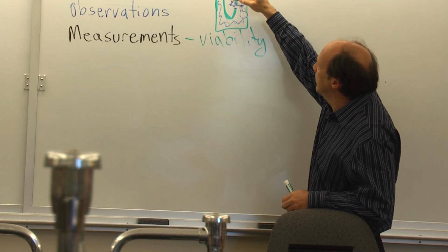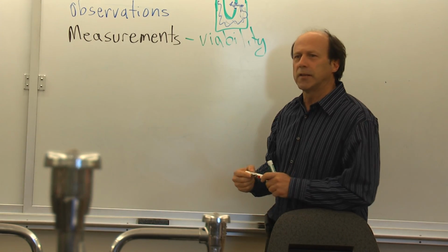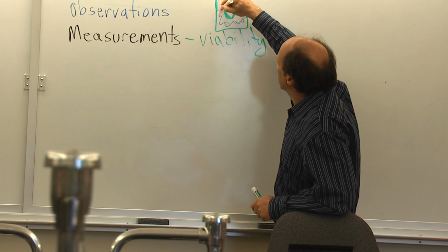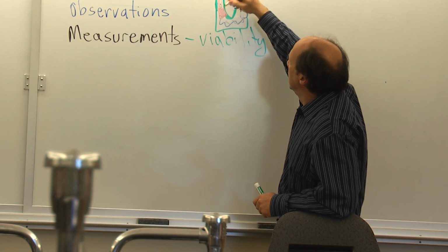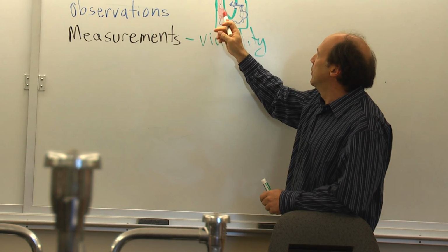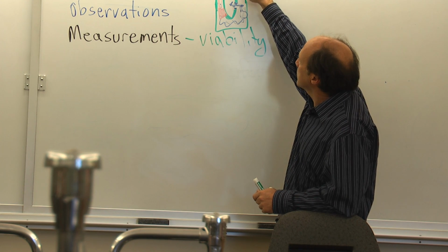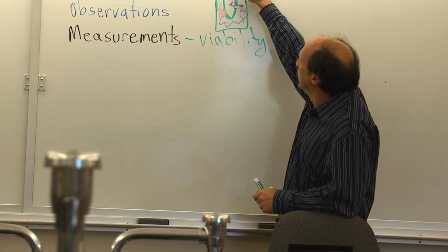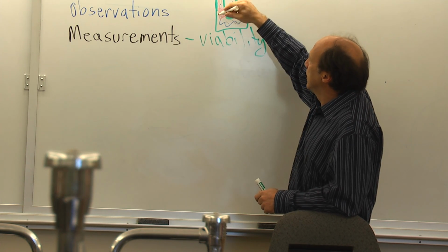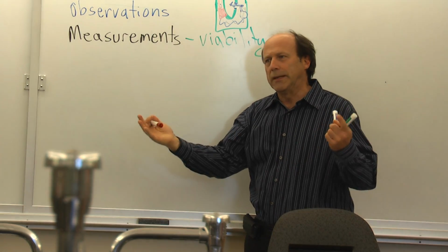So the other thing that's in this vessel is a metal plate. You should take a careful look at that today. There's a metal plate that comes down. It's a silvery plate that's hanging out inside of your vial as well. And inside of here, there's another electrical connection connecting this fluid to electricity. So there's a field that goes across those two plates, right?